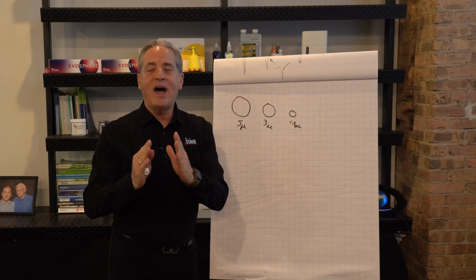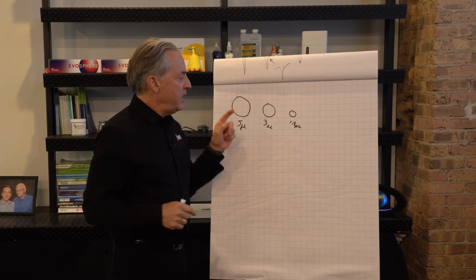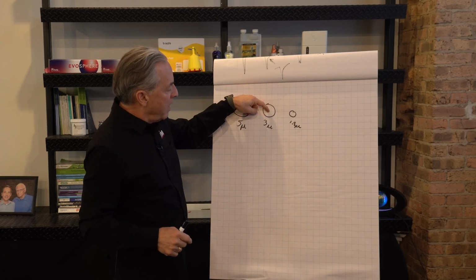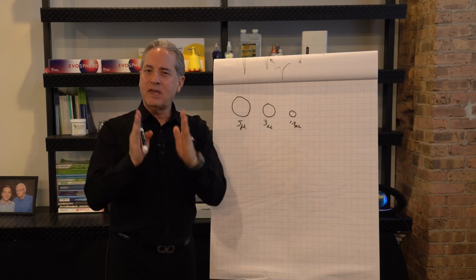I can't dictate what to do. They don't listen to me. I say, don't go too far in, they don't listen to me, but I can limit their choices. So go to a 3 micron, wow, there's a lot fewer choices. Molecules can go in 1 micron or 2 micron or 3 micron. They can't go in 4 because they've already gone over the side. So immediately my peak gets skinnier.